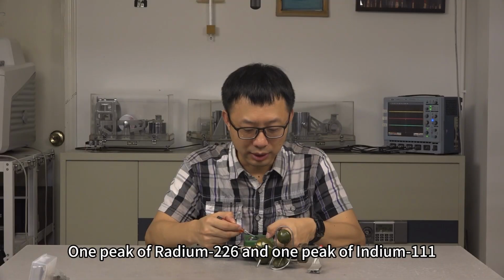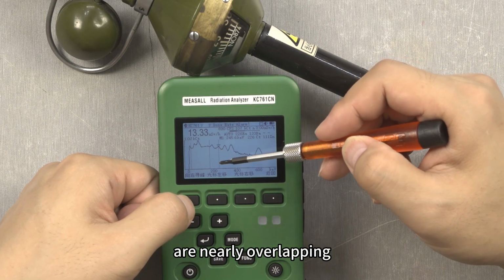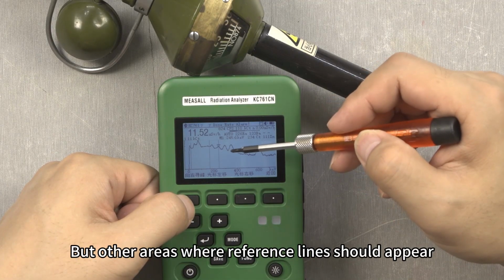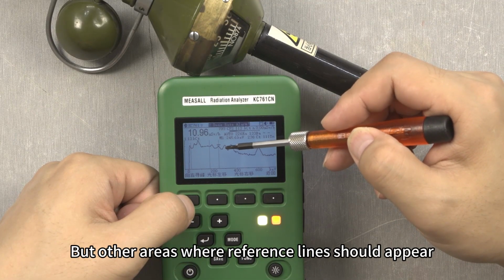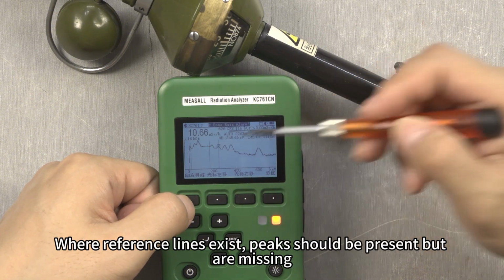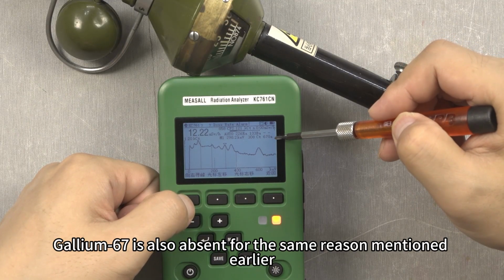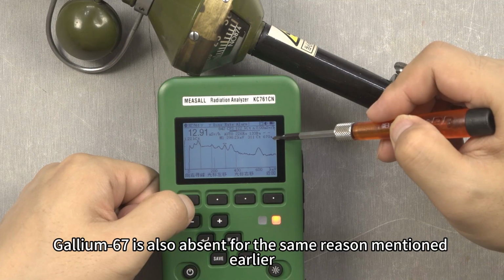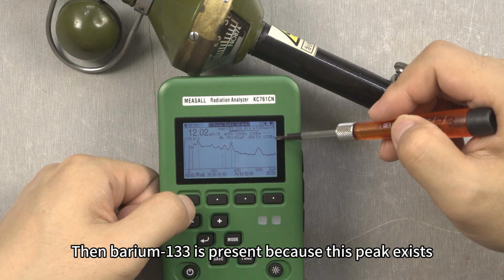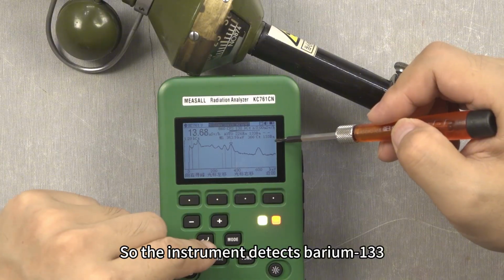One peak of radium-226 and one peak of indium-111 are nearly overlapping. Thus, a single hidden line appears that can completely correspond, but other areas where reference lines should appear are absent. Where reference lines exist, peaks should be present but are missing. Therefore, it cannot be indium-111. Gallium-67 is also absent for the same reason mentioned earlier. It is not present. Then barium-133 is present because this peak exists. So the instrument detects barium-133.